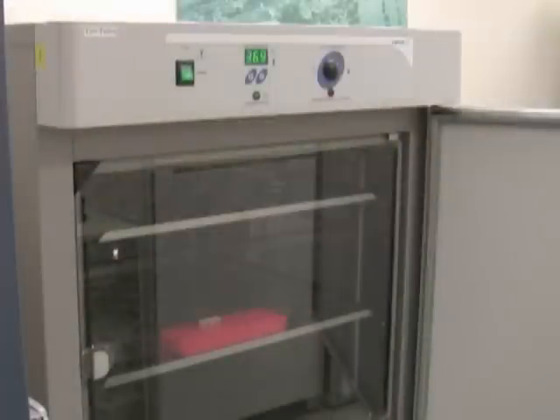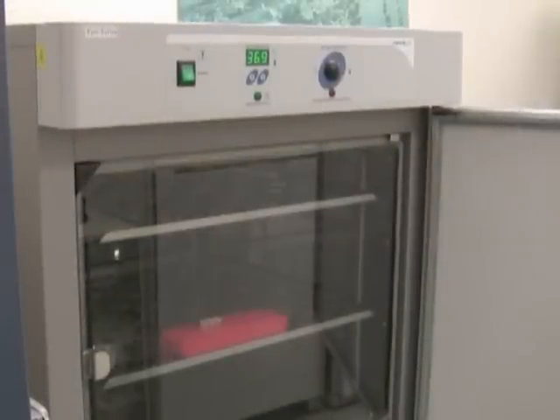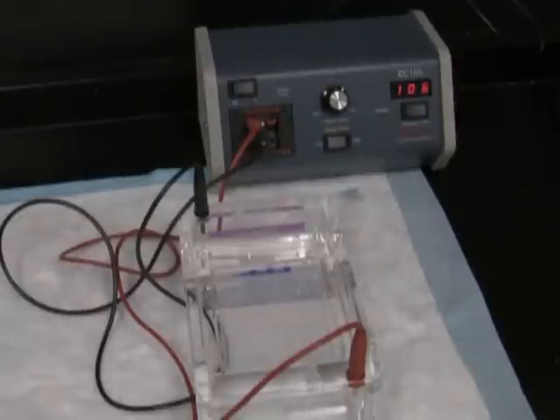As usual, I incubate the restriction digest at 37 degrees for 45 minutes. Then I will run the cut plasmids on an agarose gel.